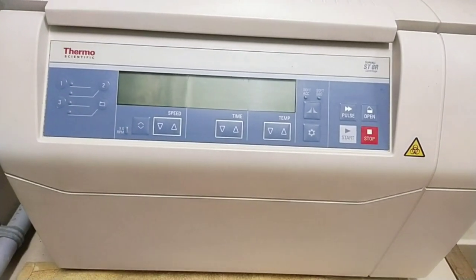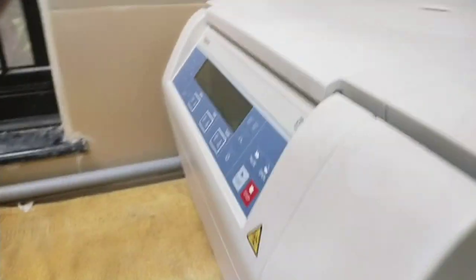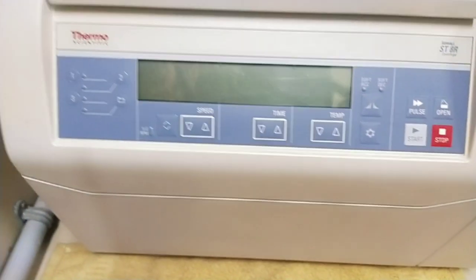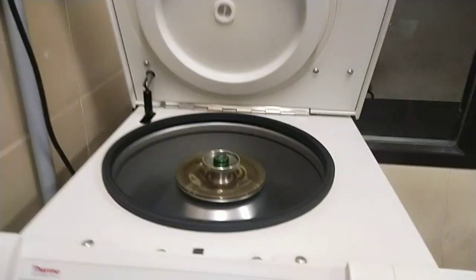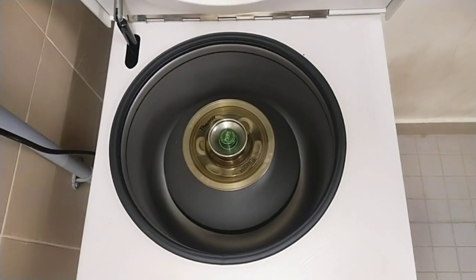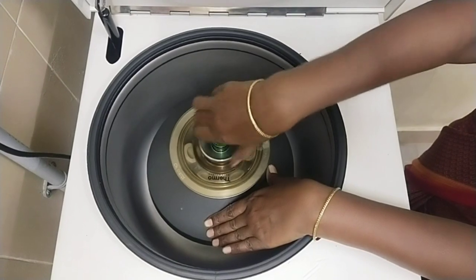Good day. Today we have a look at the Thermo Fisher Scientific Sorvall Small Benchtop Centrifuge. A centrifuge is a laboratory device that is used for the separation of fluids, gas or liquid based on density. A centrifuge operates by using the sedimentation principle, where substances are separated based on their density under the influence of gravitational force.